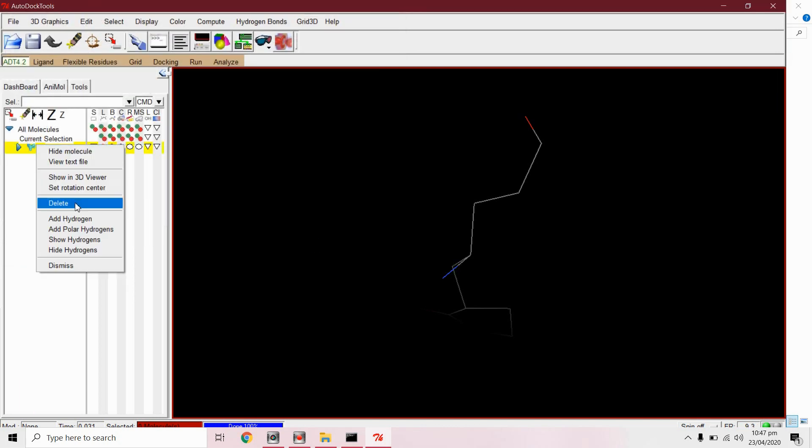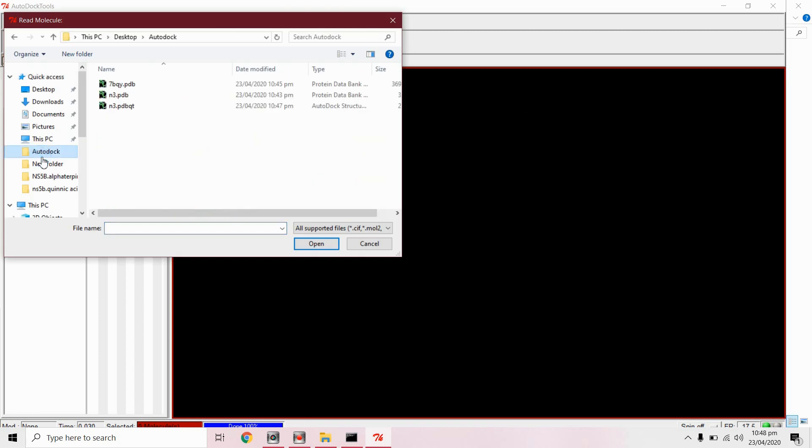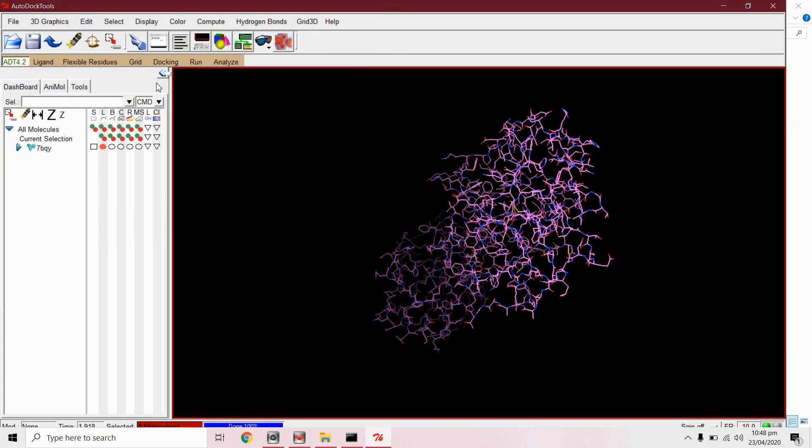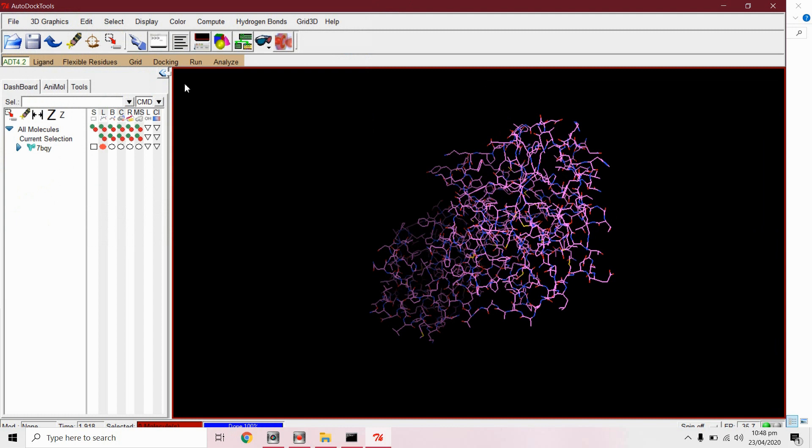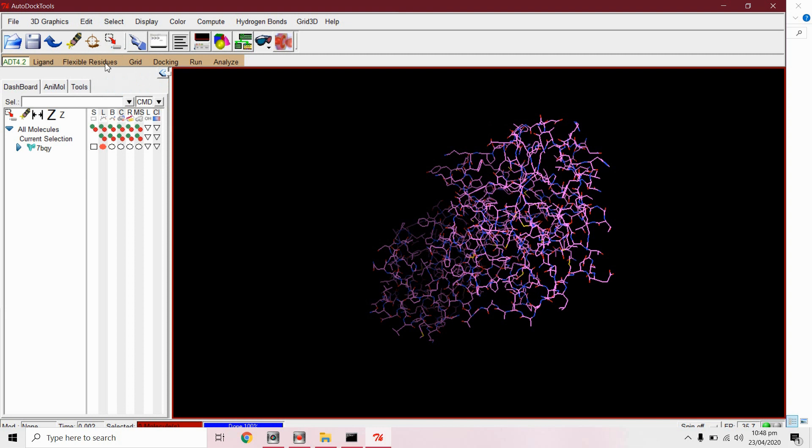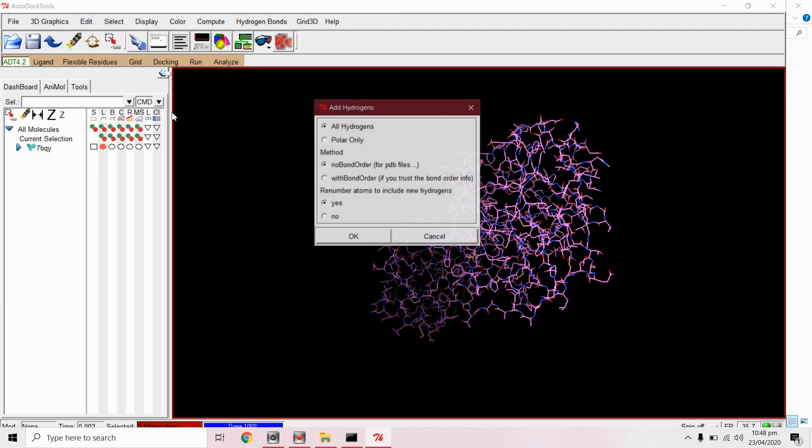Read protein molecule. First we will delete from edit delete water. We have already deleted it. From edit hydrogen add polar only.